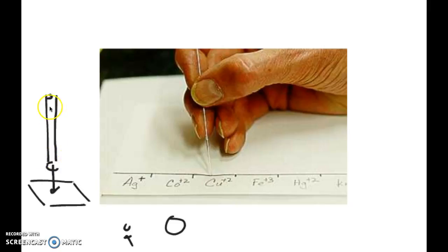Here's how you're going to apply the sample. You notice that I recommend holding the capillary tubing upright and just dip it and hold it, push it down so the sample goes to the paper. You don't need to do it too hard. The water would transfer to the paper pretty quickly, and you don't want to have too much of it goes in there. So dip it one time and then that's it.